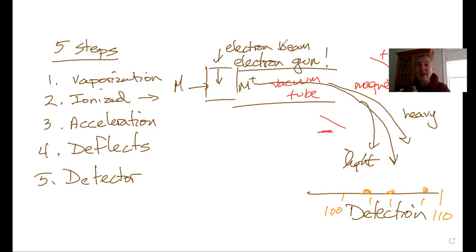And I can get very, very detailed information about the mass. I've used something called high resolution mass spec, in which you can tell the difference between carbon dioxide, which I think is 43.9 something, and C3H8, propane, which is 44.1. You can easily tell those apart. So that is the big idea.